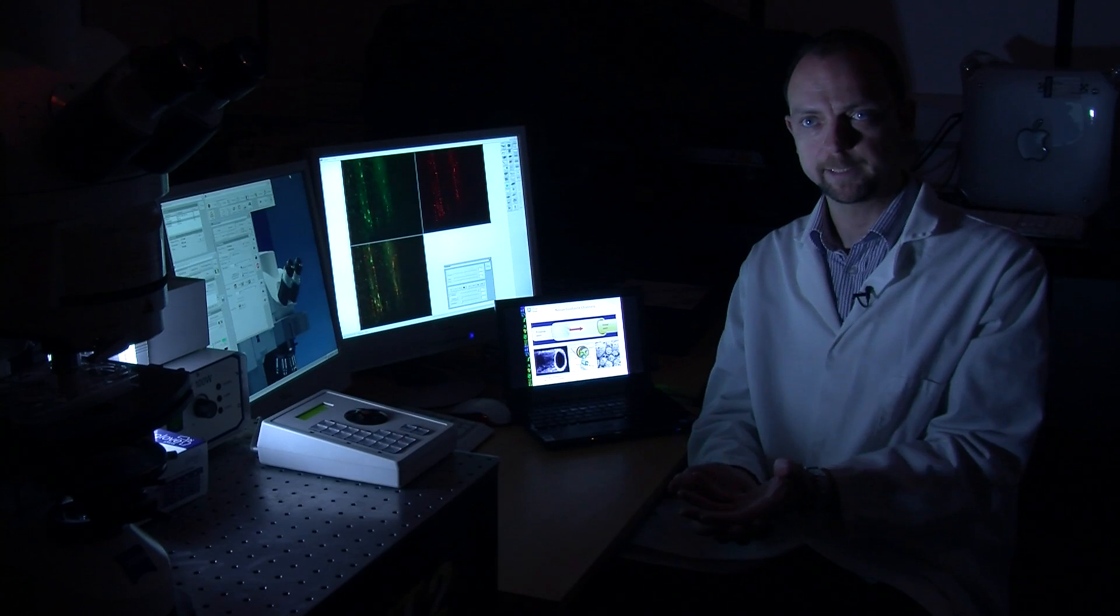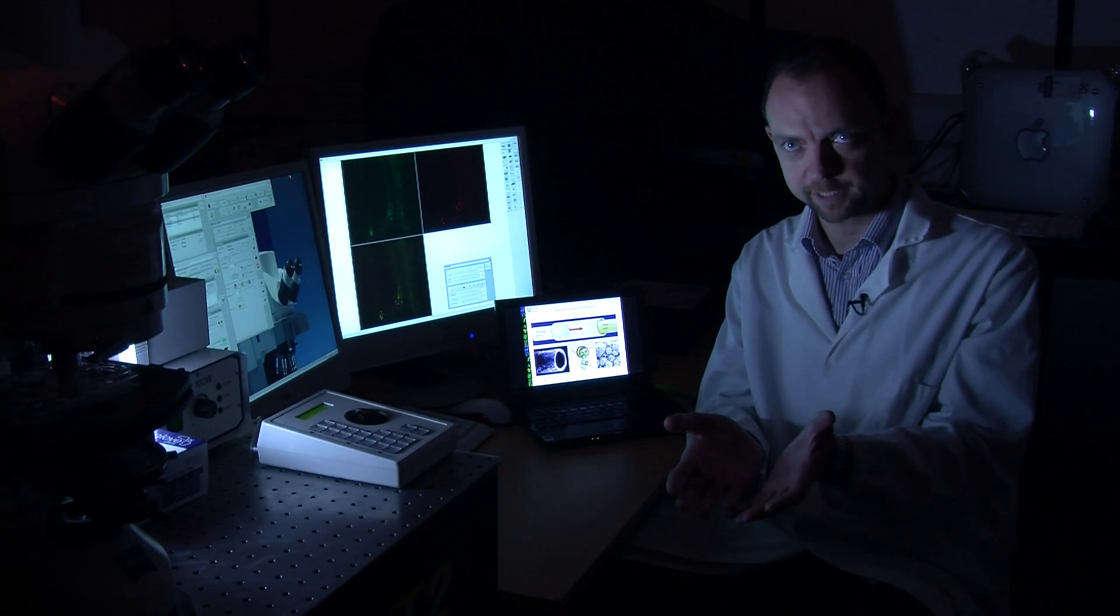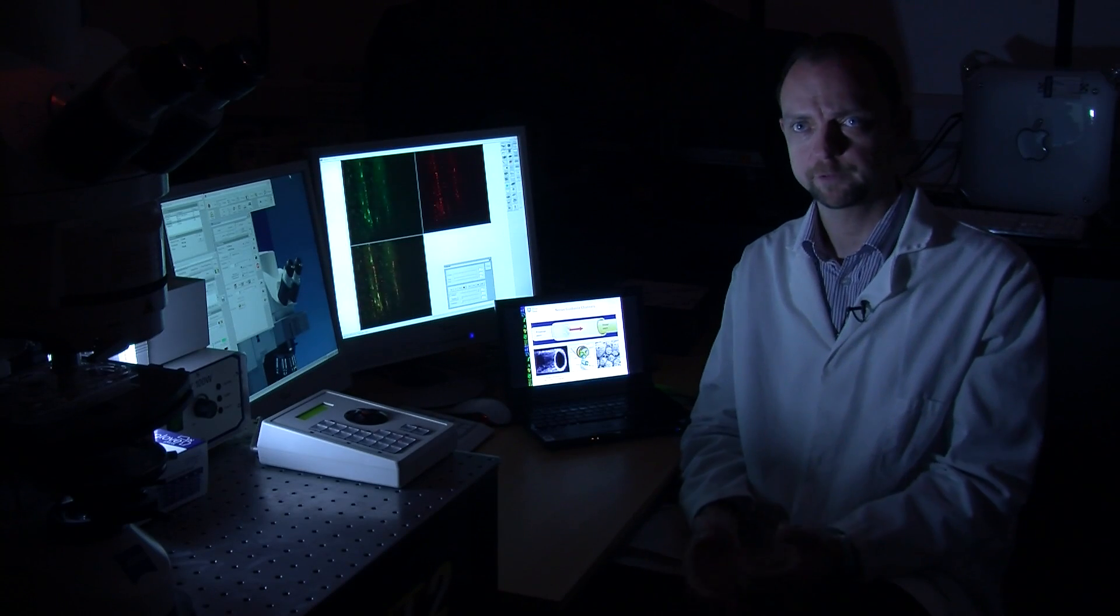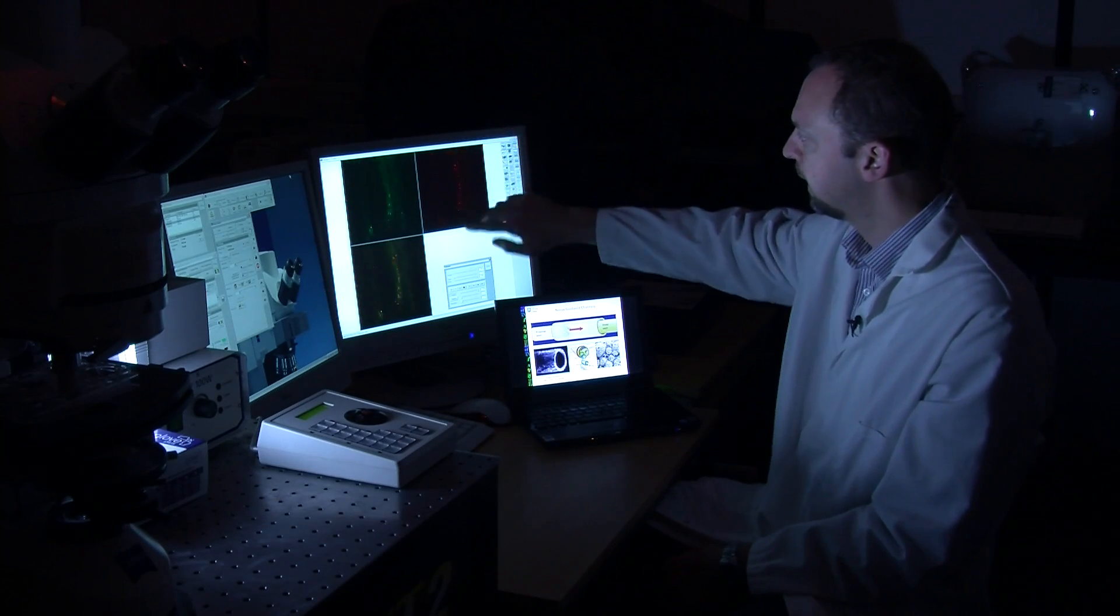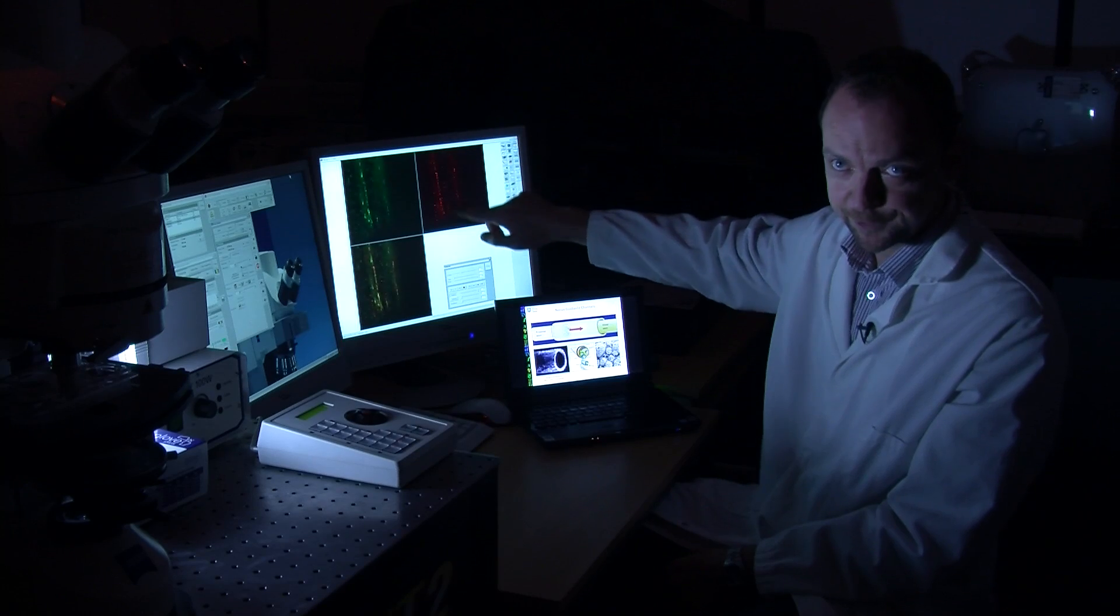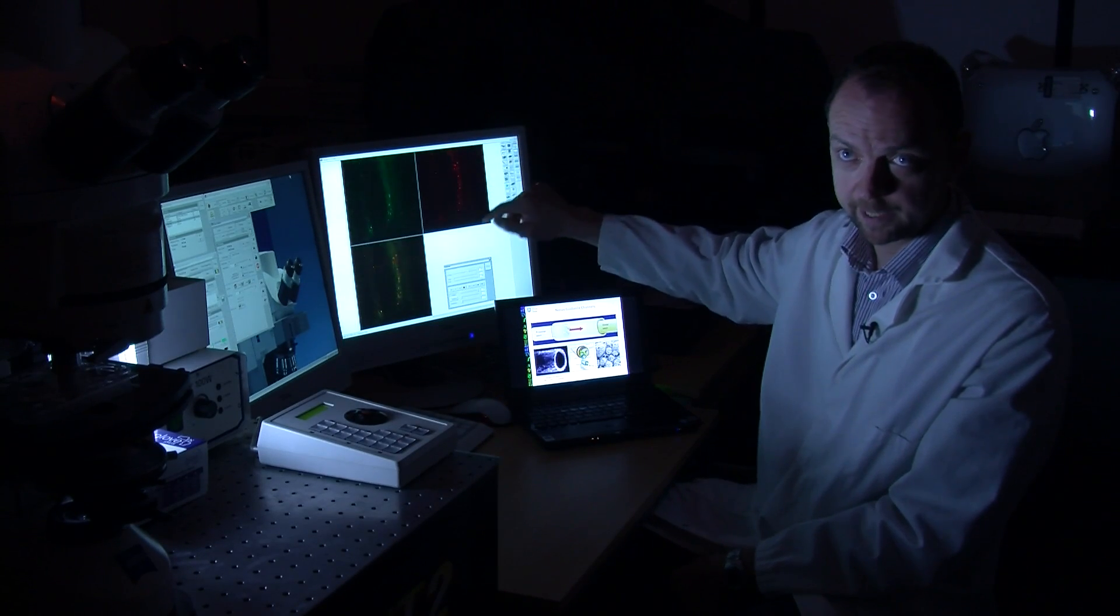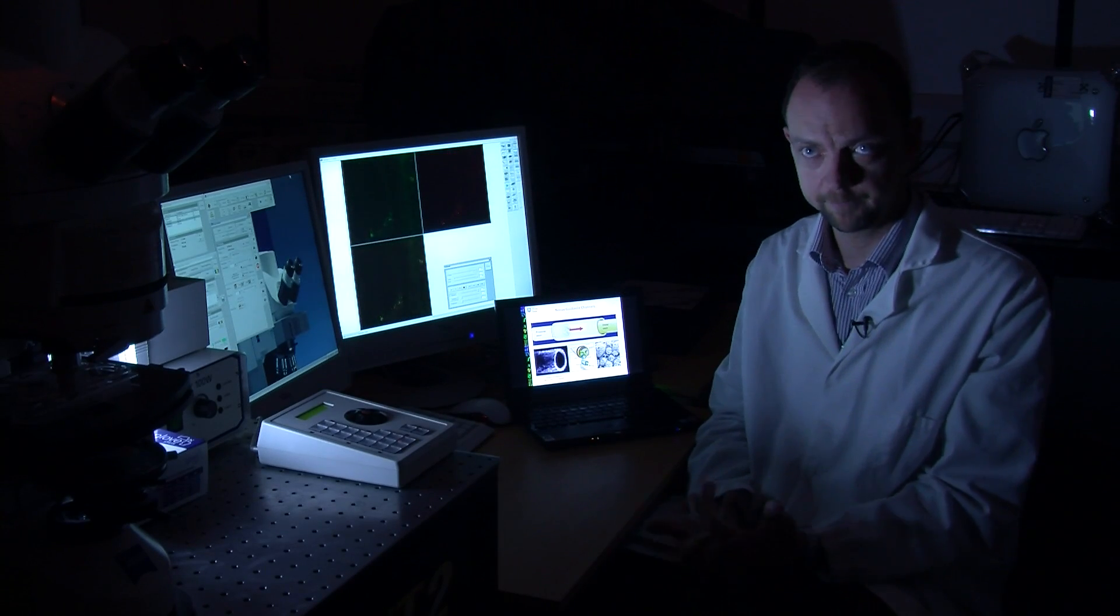We can simulate that in a simple experiment by putting the two together - the nerve cells and the fibers together - growing them and then imaging using this microscope. The basic question we're asking is very important: do the scaffolds support the growth of those aligned nerve fibers? What we see on the screen here is hundreds and hundreds of individual aligned nerve fibers that have grown along the scaffold. That tells us that these particular scaffolds do indeed support the growth of complex nerve cells.